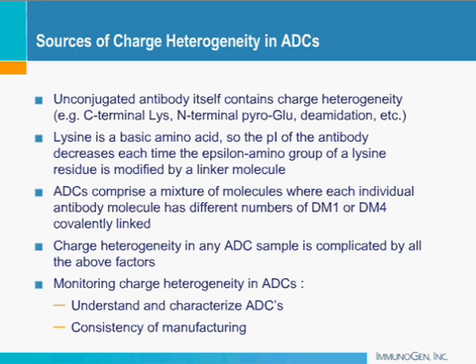Going on to the next example, you have the separation of an antibody-drug conjugate by a traditional CIEF method. And although the resolution is slightly better than cation exchange, it is nowhere close to what you can attain by ICIEF. And you still see that the peaks are kind of separated, but it's still very noisy and unclear.